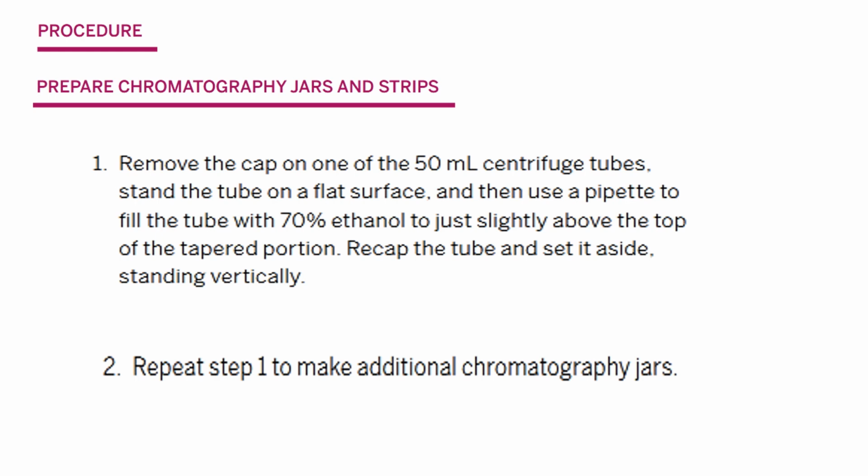So we'll use 50 ml self-standing centrifuge tubes as chromatography jars. We want these tubes to be saturated with the solvent vapor before we use them. So prepare them at least a few minutes before you intend to develop the chromatograms.